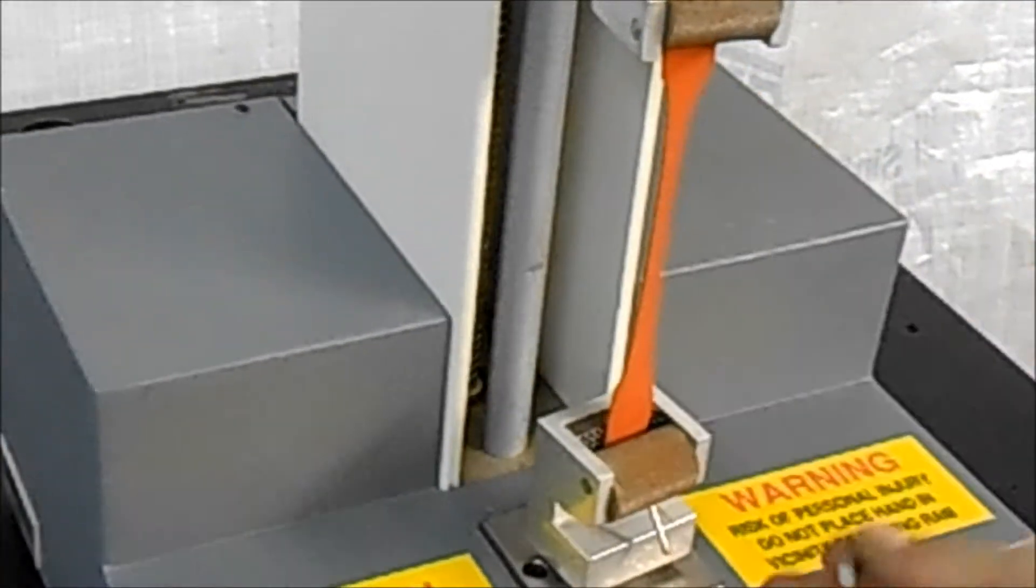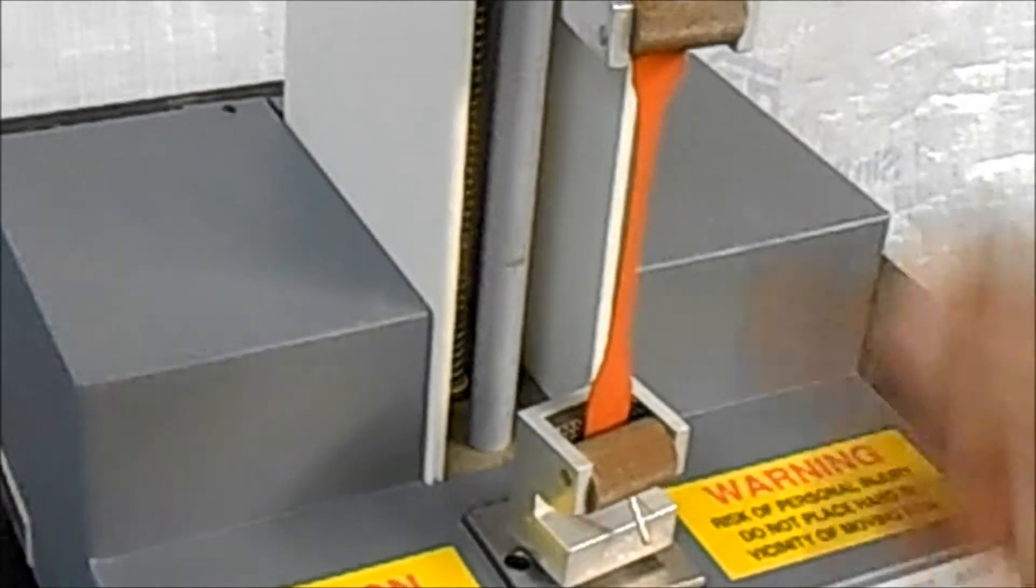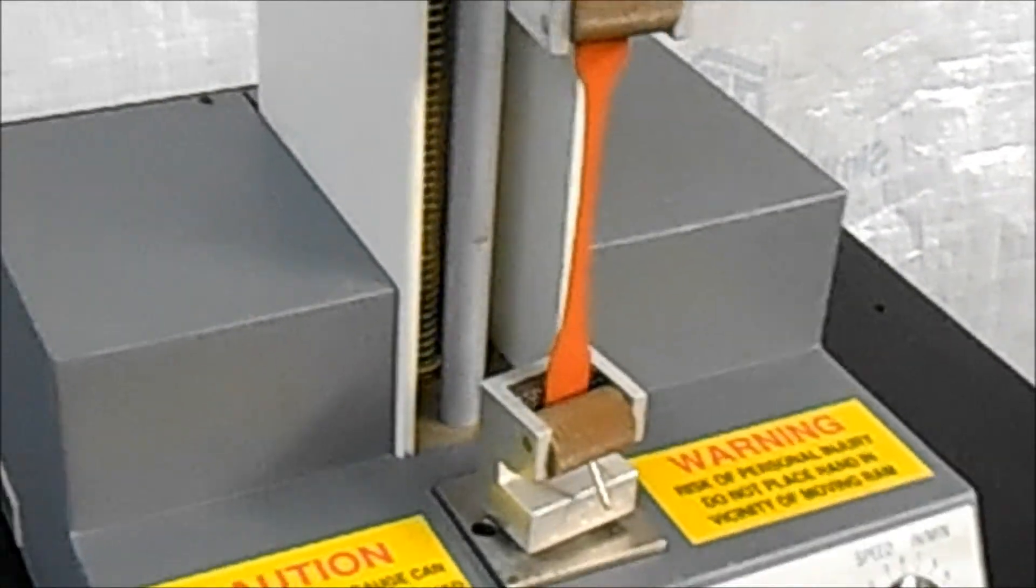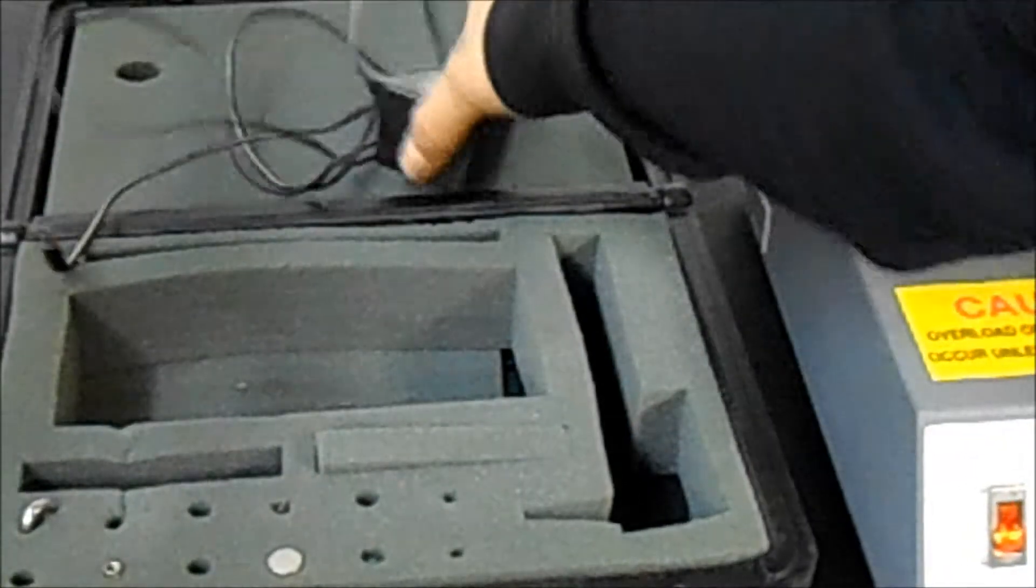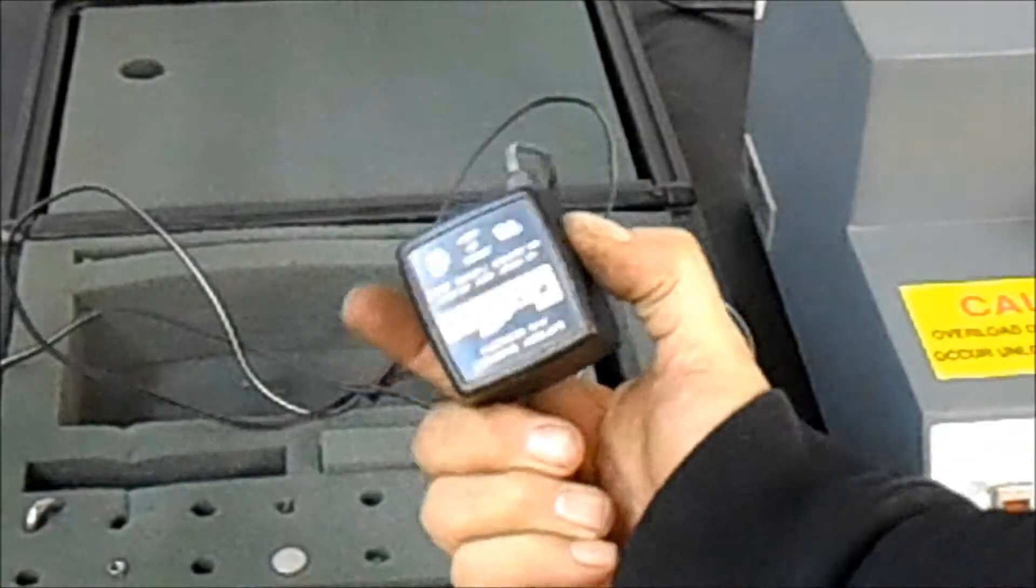We can put ends like this on the upper and lower part of the system here for pulling the sample. And there is an extension battery charger for the DFIS-100.